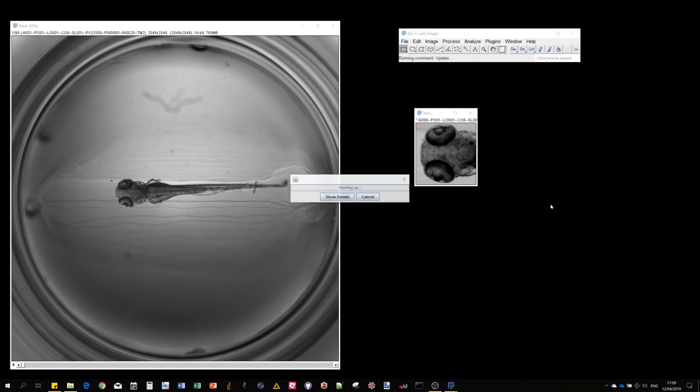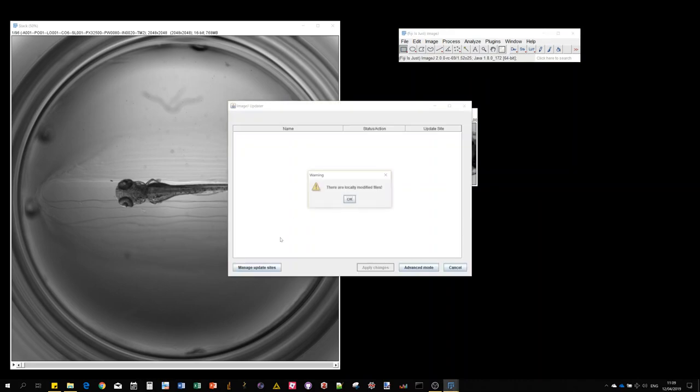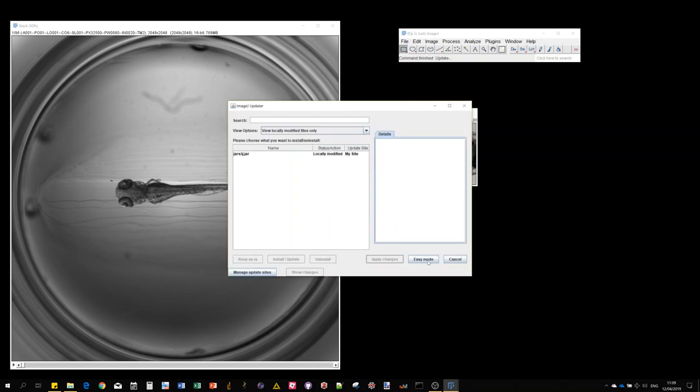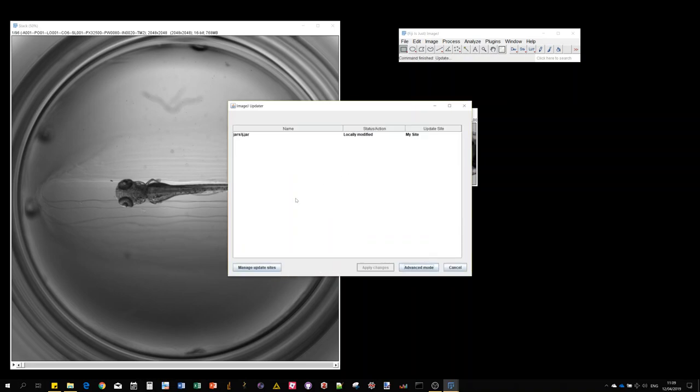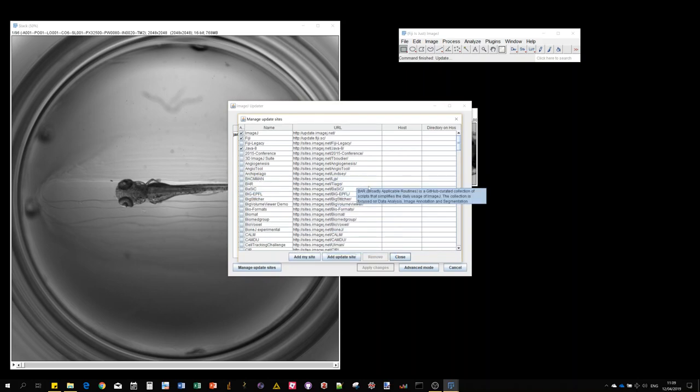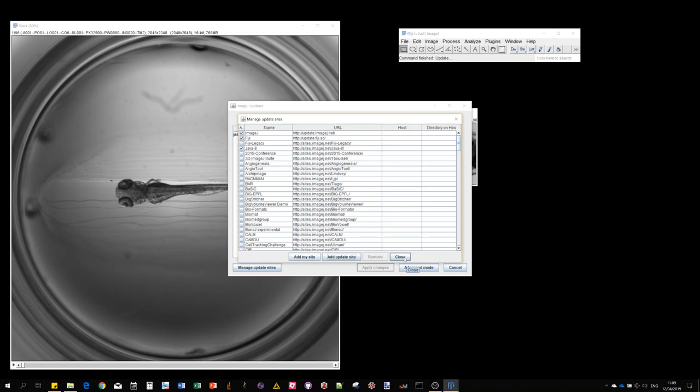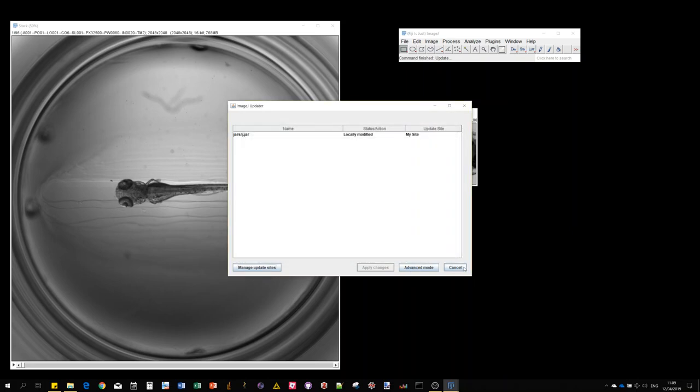It's available from an update site that you install by calling Help > Update. You open the Fiji updater, click on manage update site, and you'll see a list of update sites that you can tick to download additional plugins. Ours is listed under multi-template matching.